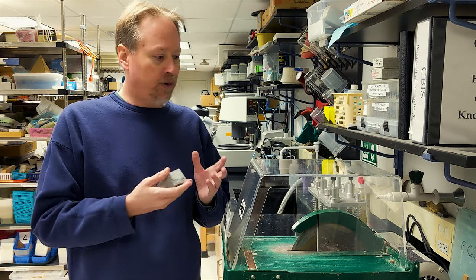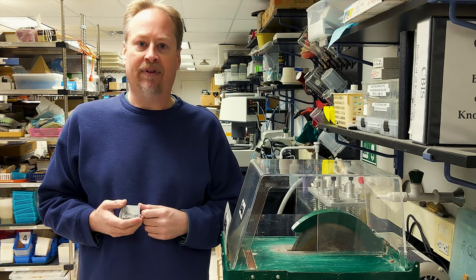With that said, I'd like to turn things over to one of our student volunteers, Sarah Yoon, who will show us this and some of the other equipment we have here in the lab.